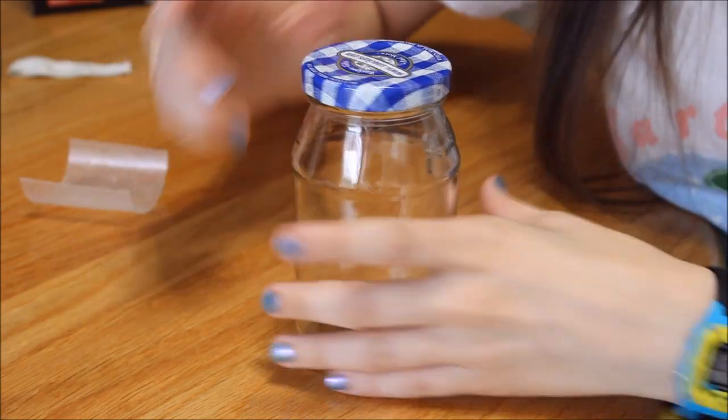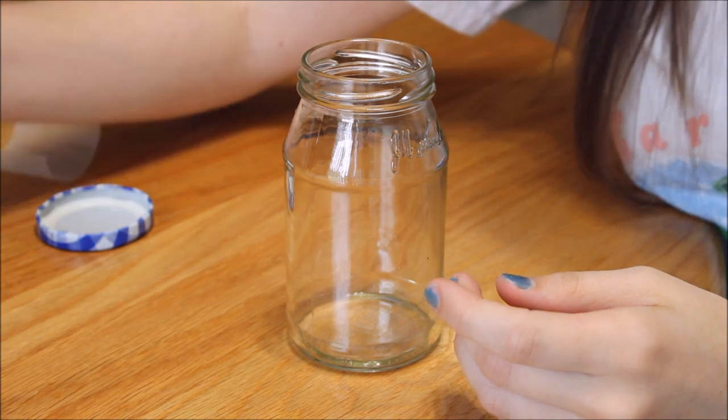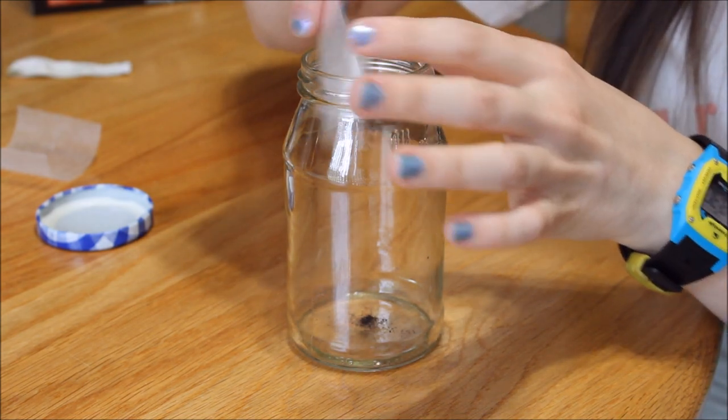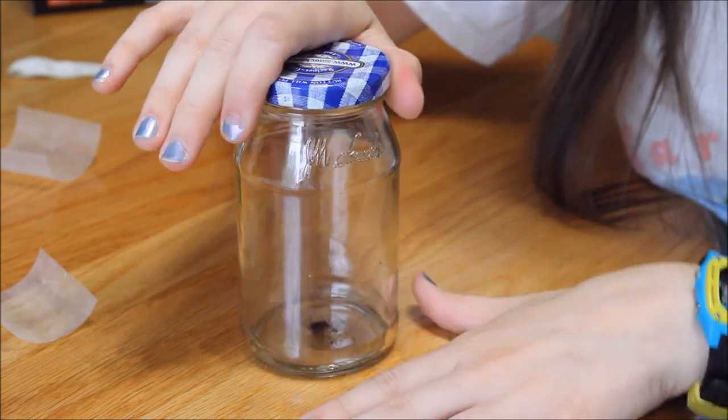All right, so here's our empty jar. I'm just gonna be adding the Alcian blue powder. Here we are. Just want to make sure you shake that off really well. Next, we're going to be taking 60 milliliters of our 95% ethanol and pouring that into our jar with our Alcian blue.